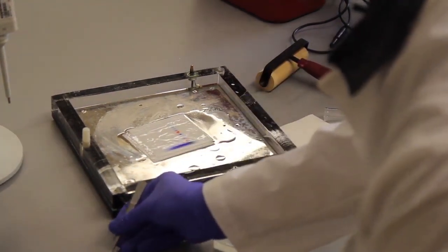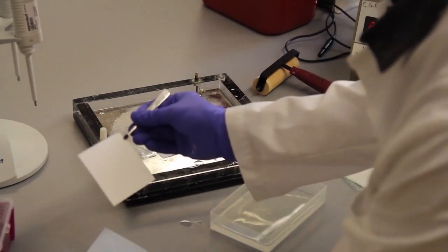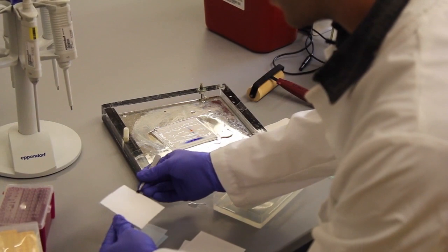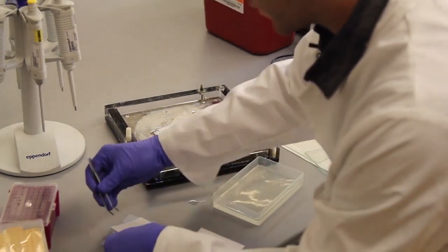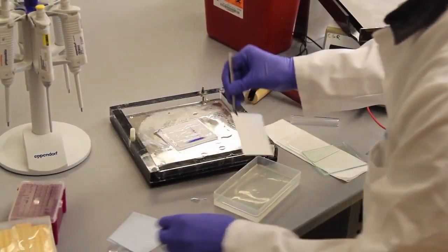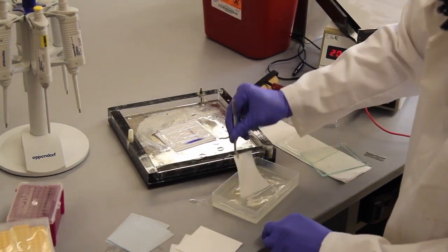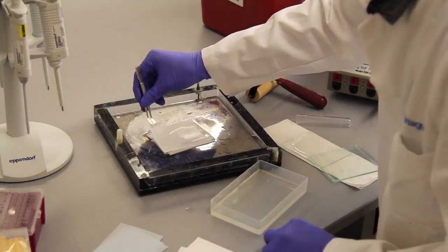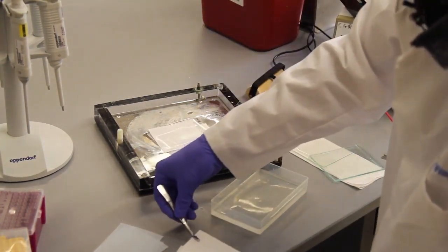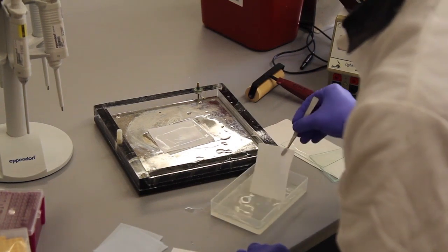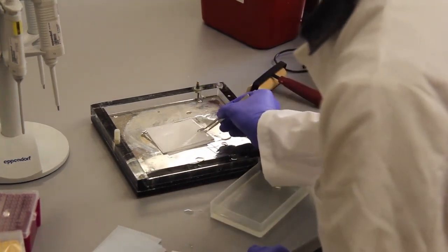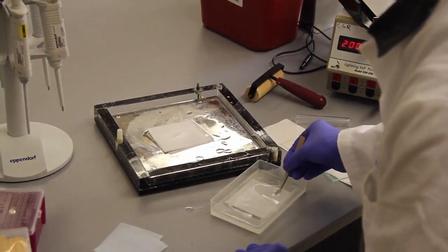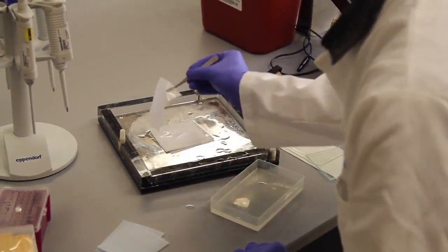Next up is the nitrocellulose membrane that usually comes protected within a few other sheets of paper. Make sure to remove those first, otherwise the transfer will not work. Again, pre-soak it and add it on top of the gel. And to finish it off, three more pieces of Whatman paper. The main purpose of the Whatman paper is to protect the entire sandwich from the current going through and to help ensure that the current goes through evenly.